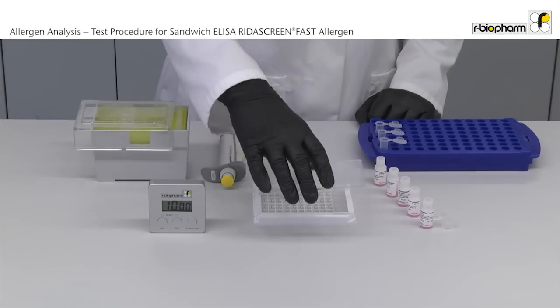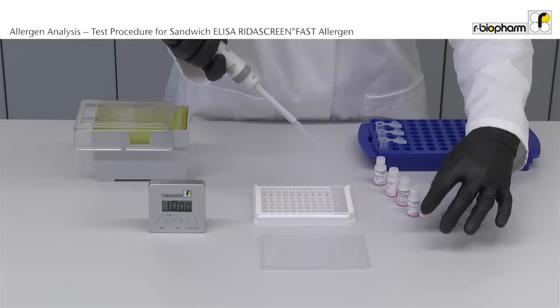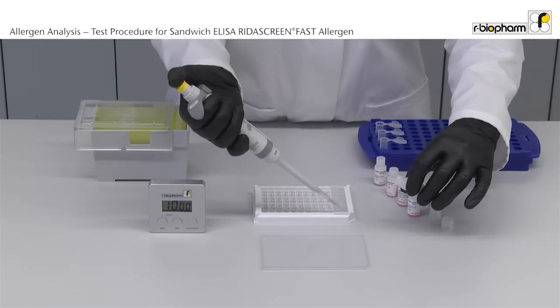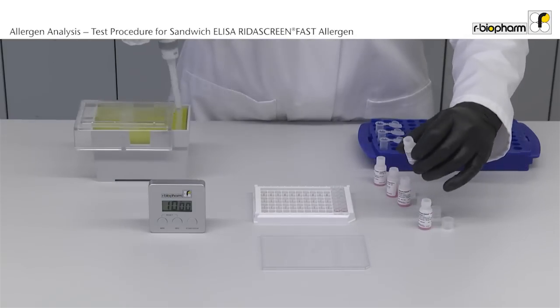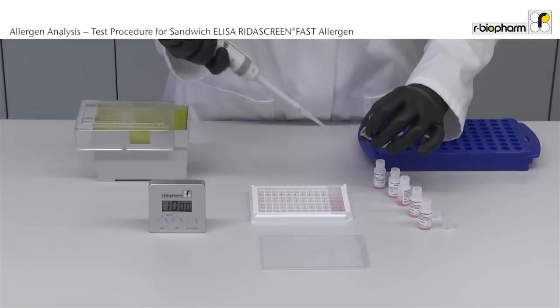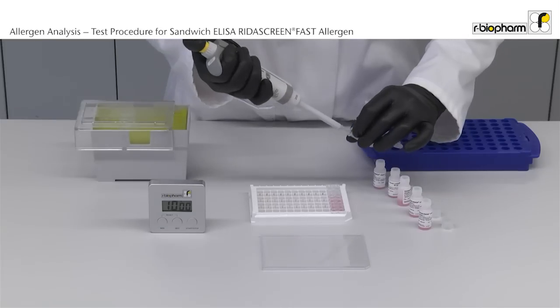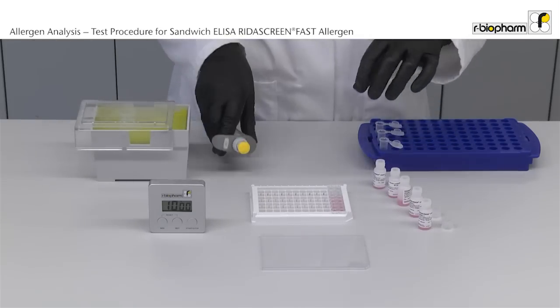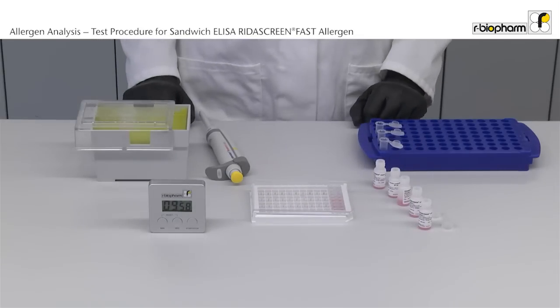Pipet 100 µL sample or standard per well in duplicate. To save time, all vials are already open. Incubate for 10 minutes at room temperature. Put a lid on the plate.